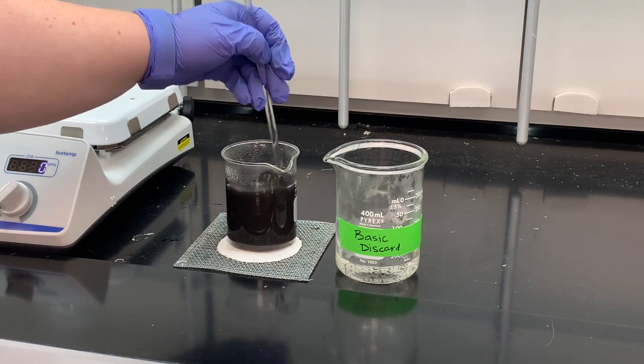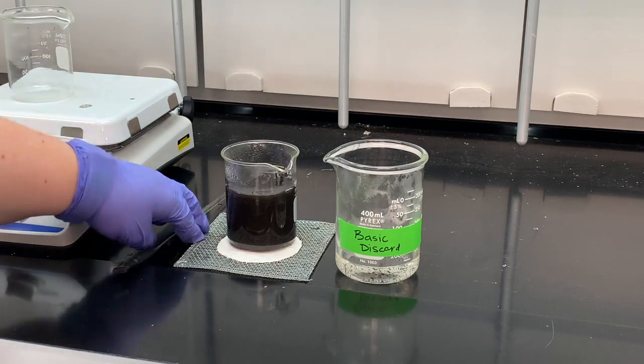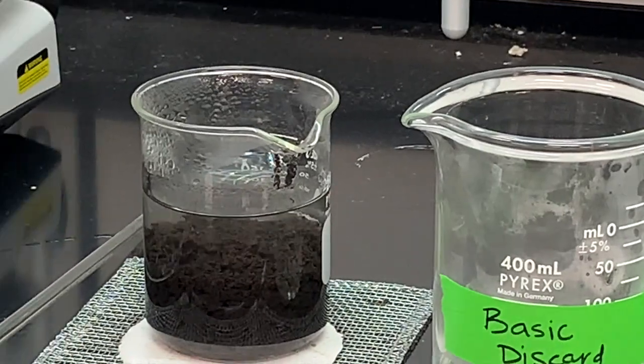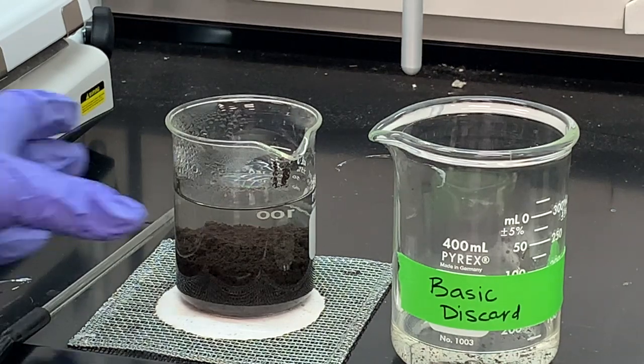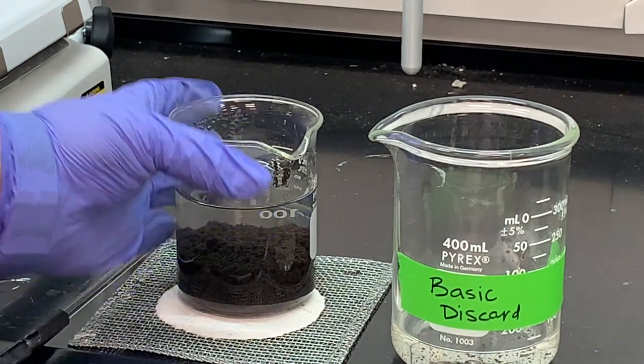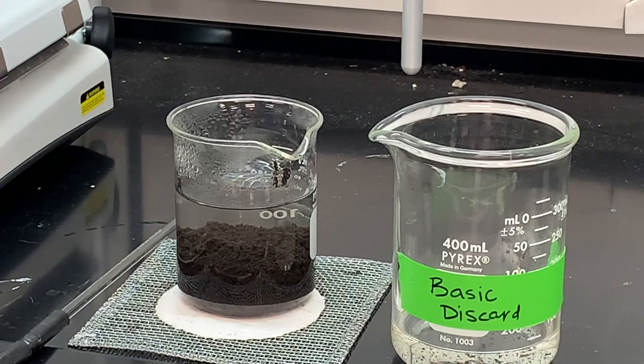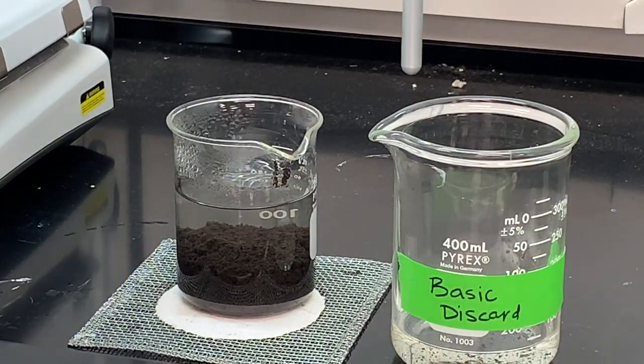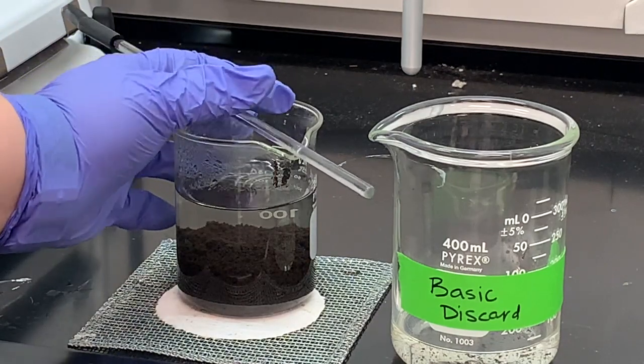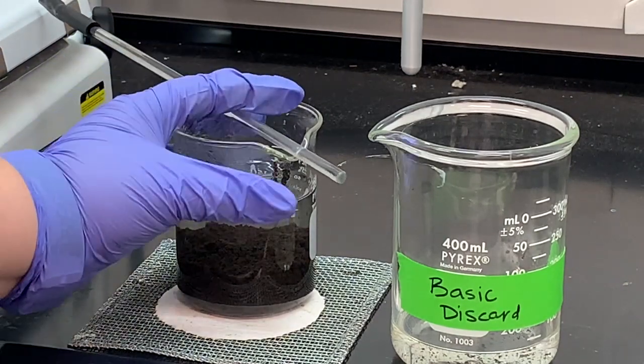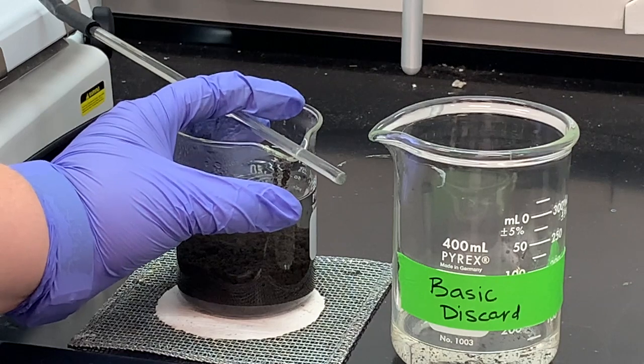And then I'll let this cool off again and settle and decant it again. So our solution has separated again. I'm going to go ahead and decant this one more time into the basic discard before we move on to the rest of the reactions. Remember that we're not going to be able to decant this to dryness.